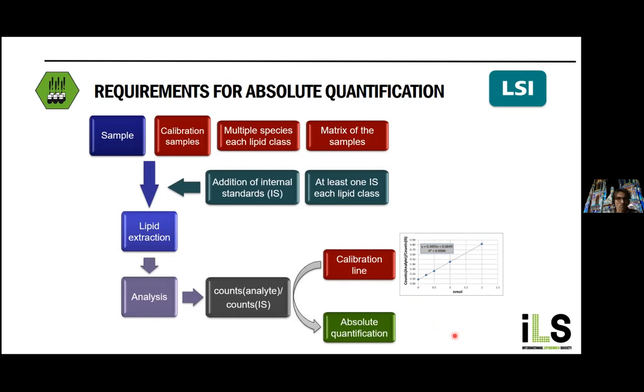In most cases for lipidomics, we do not have all these species available as reference compounds with the precise concentration. We frequently use one calibration line to calculate multiple species. If you target only a few molecules, you will have them as reference standards, and so you can get very accurate concentrations.